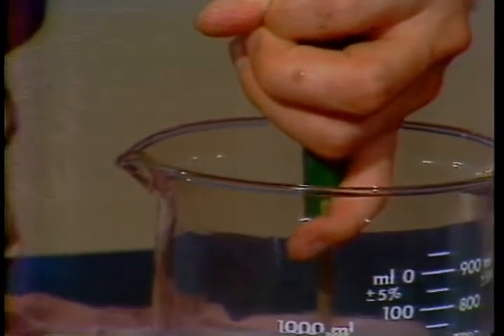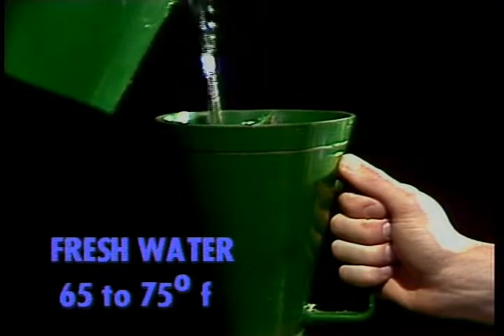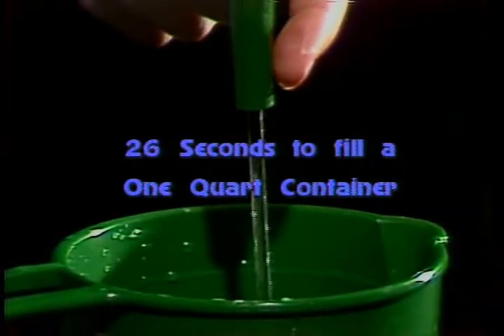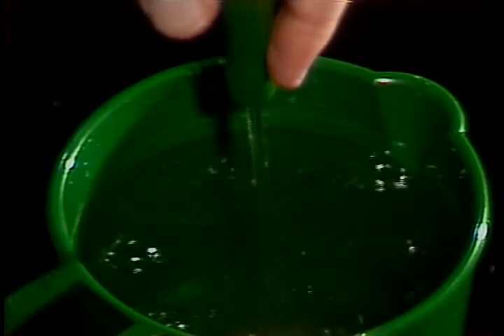Just like with your mud balance, you ought to check the accuracy of your funnel every now and then, or every time you start to use a new funnel, or one you haven't used before. It's done with fresh water between 65 and 75 degrees Fahrenheit. It should take 26 seconds to fill a 1-quart beaker. If it's not within half a second of this, you'll need to figure out why.